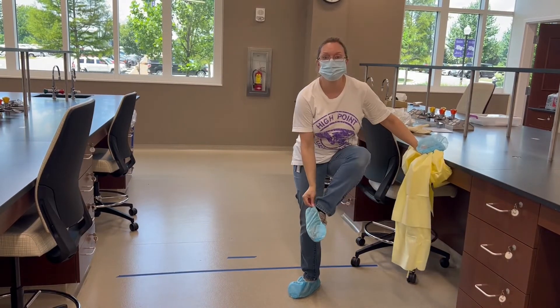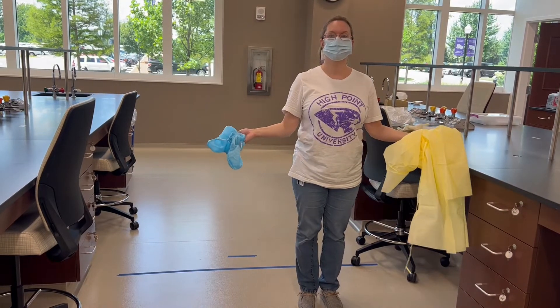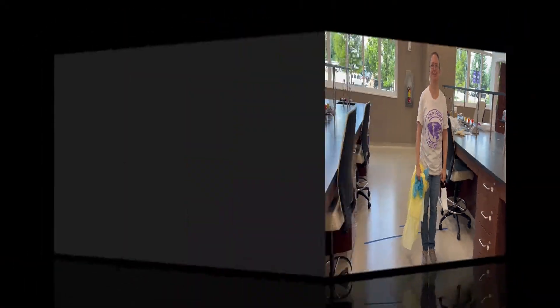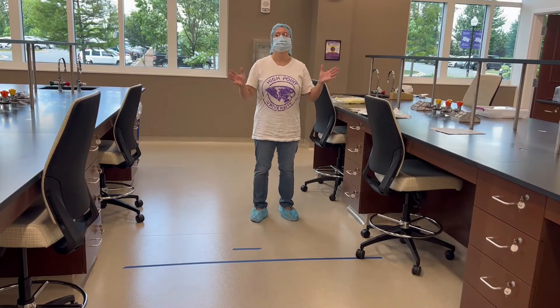Remove the bonnet, remove the booties, and of course the face mask if you want to remove it. Clean hands — we're now ready.